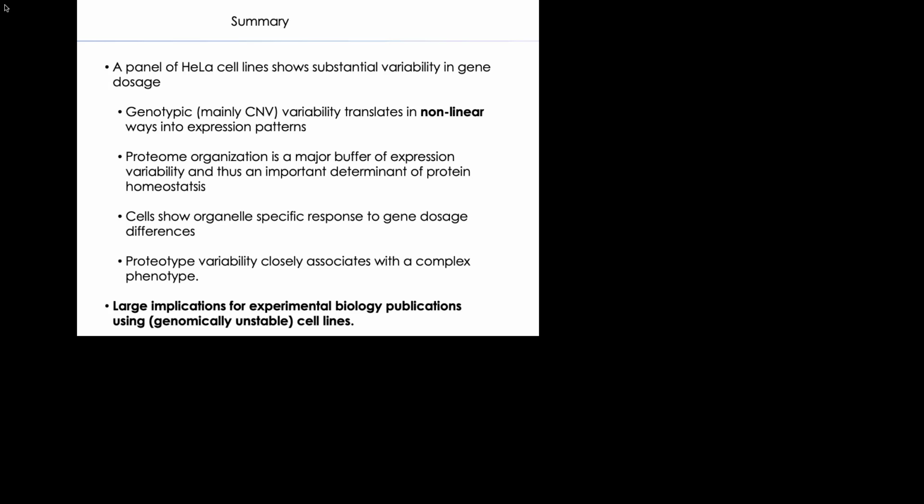And I would say in the technical arena, where we do a measurement, we have tools that try to get results like protein quantities and identities from this data. We are doing quite well in proteomics. It is quite well benchmarked in terms of the acquisition of data, in terms of the analysis of data. So this is encouraging, but where we see clearly a big source of reproducibility problem is the biological basis of the material that we use, in this case cell lines.